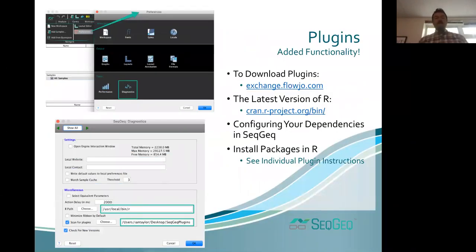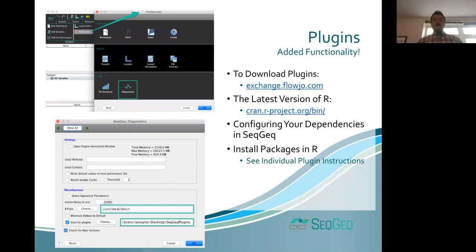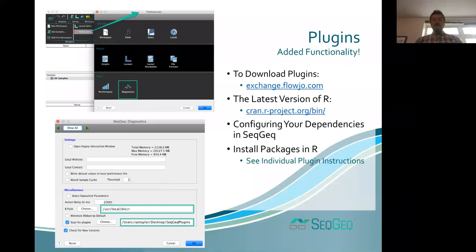We also have plugins in SeqGeq. It's important to be aware of these early, because if you want to use them in downstream analysis, you need to have them set up. Many plugins require a connection to R. To set that up, visit the SeqGeq preferences diagnostics section, where you can enter your R path — here you see the default R path for a Mac; it'll be different for Windows. You'll also need to point SeqGeq to your plugins directory, where you store the JAR files associated with each plugin.